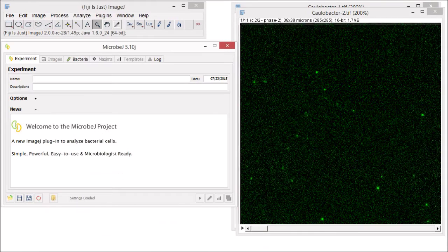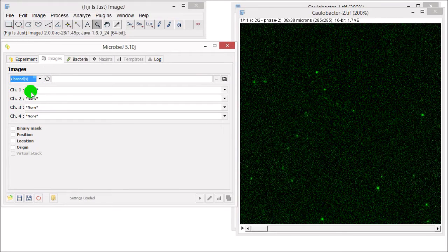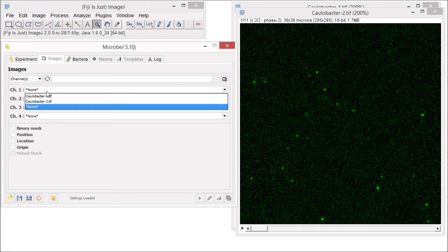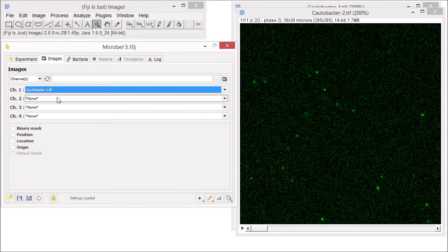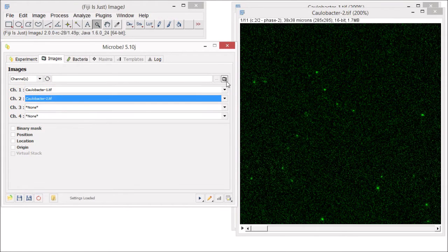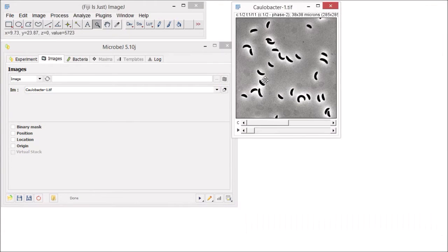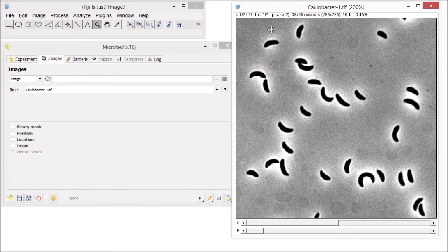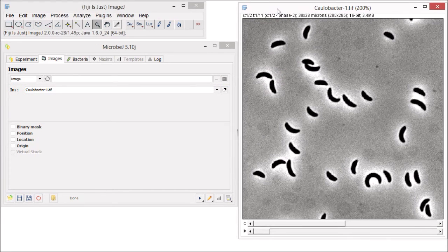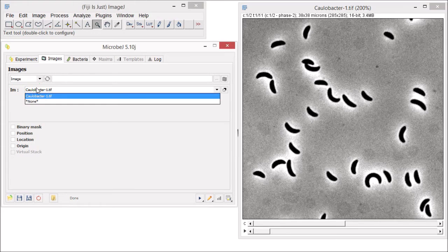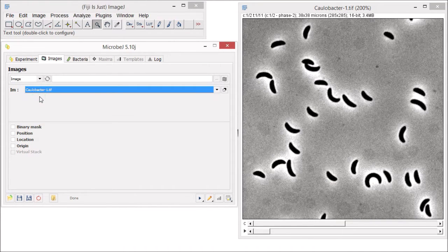If you already have both the phase contrast and fluorescent image stacks open, you can use the channels input mode. Assign each stack to a channel and click the open images button, and they will be combined into a hyperstack, and the image input mode will automatically change to image. Of course, if you already have a hyperstack, you could have selected the image mode right at the beginning.